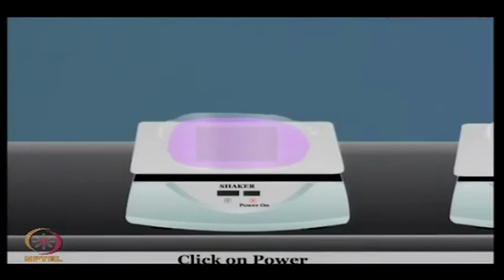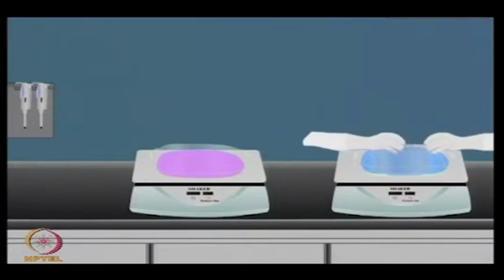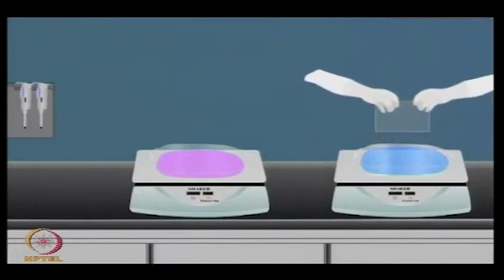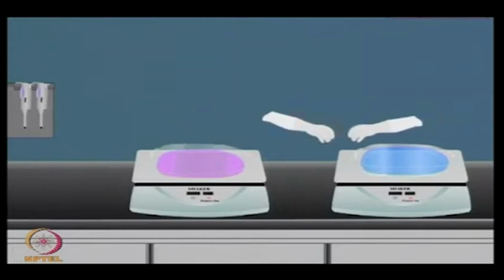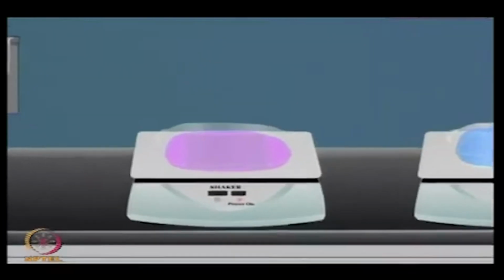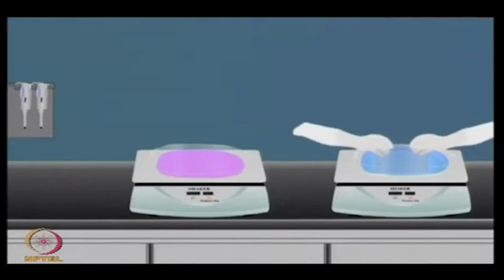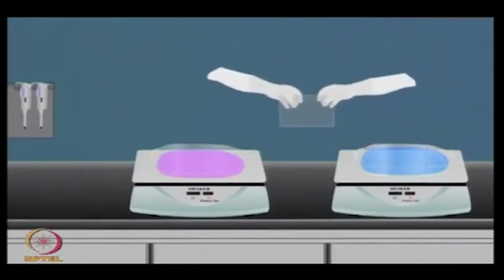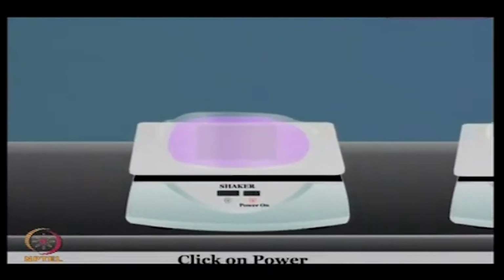You need to ensure that proper shaking conditions are maintained, and you need to allow 10 to 14 hours, usually an overnight step, for the staining as well as de-staining steps. After de-staining is done, you can see protein spots on the gel with a very clear background.